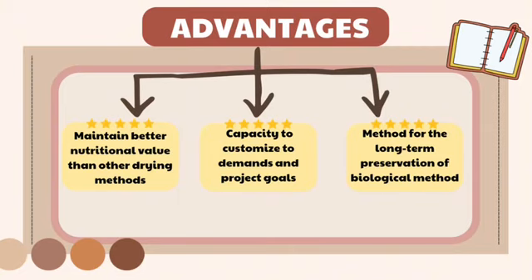It is because freeze drying has been developed for bioactive molecules, pharmaceutical products, and other medicines. Lots of pharmaceutical products use freeze drying as the process for dehydration and improving stability, such as virus, vaccine, protein, and colloidal carrier. Lyophilization is used in the pharmaceutical and biotechnology industry to improve the stability of formulations. The active pharmaceutical ingredient will be solubilized in the water.